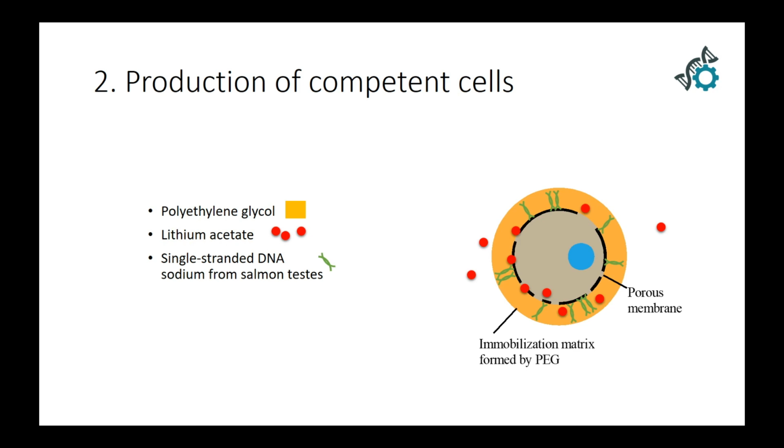But we are also adding DNA from our beetle. So we do not want our DNA to interact with the membrane. We want our DNA to be able to enter the cell. So to eliminate the possibility of our exogenous DNA adhering to the membrane of the cell, we add a lot of salmon sperm that contains many DNA molecules, and they will make interactions with the cell membrane here, blocking off the possibility of our genes adhering to the outside of the cell.